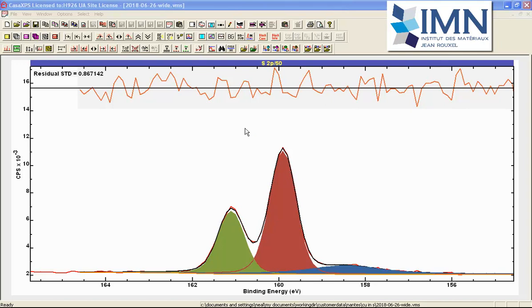Another input to the peak model are the line shapes. We have line shapes here representing sulfur 2p, and a different line shape representing the Gallium 3s. These line shapes are inputs, and when we fit the data, the parameters we adjust are the position, the full width half maximum, and the area.